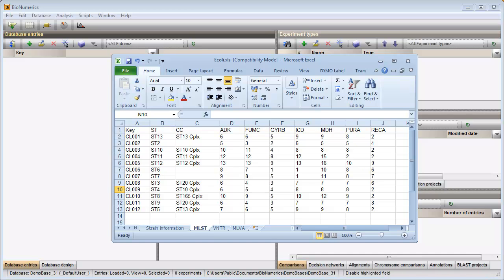As an example, I will make a selection only containing the first four rows.